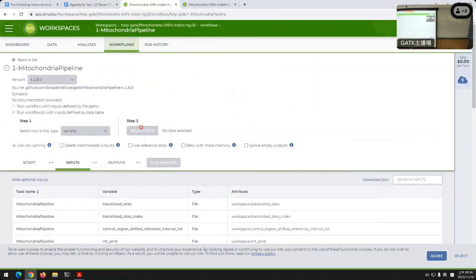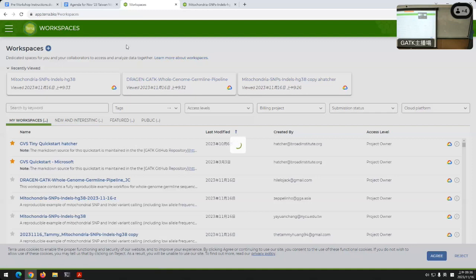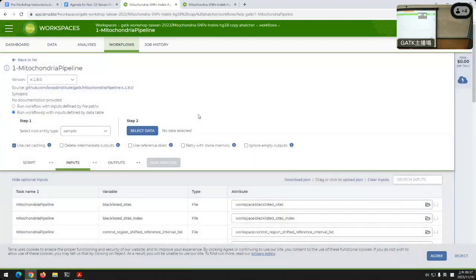Note though that a lot of things are grayed out here. I can't just run it. That's because this is the shared workspace. I'm only a reader. That's better. I'm only a reader on this. See, read only. If you want to actually run it, you click the menu over here and click clone. If you clone it, you can name it. You have your own copy. And then you can run it all you want to. It turns out I've actually done that already. Among my workspaces, you'll see a copy of that with my name under it. That's me. So you see, because I'm in my own copy right now, the buttons aren't actually grayed out, right?